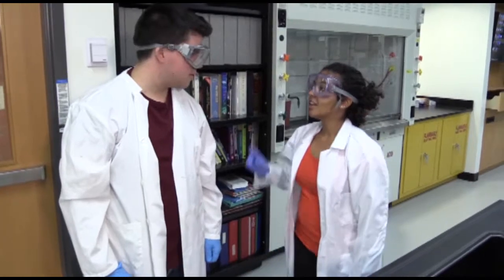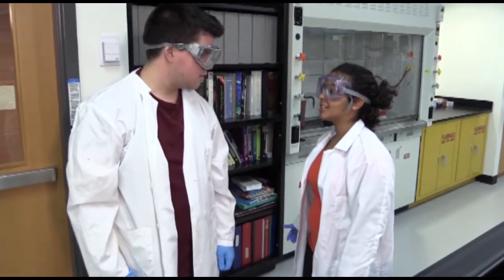Let's do this experiment. Not yet. First, your pre-lab talk by your TA or supervisor.